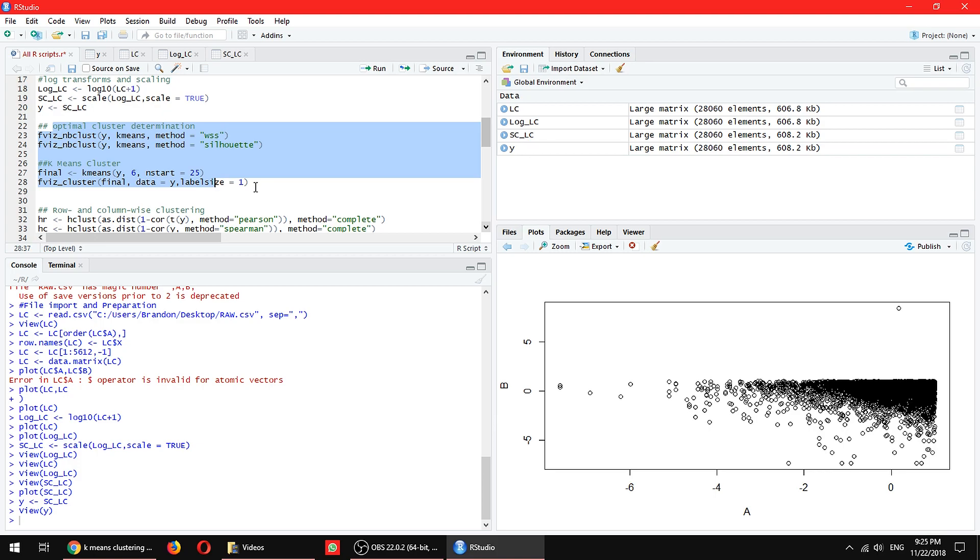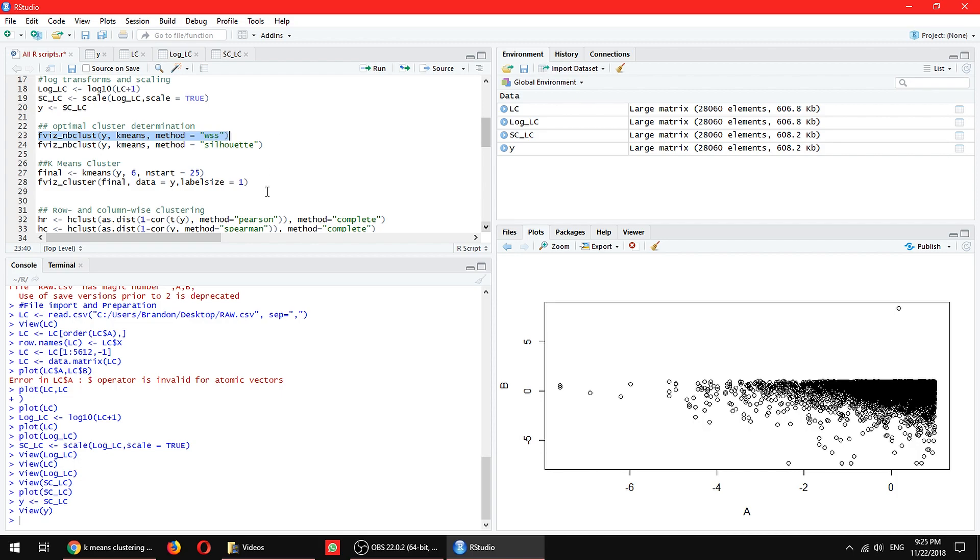The code here is fairly simple compared to what we have just now. So the first one is this elbow method. It's also called WSS here. I'm not sure why I haven't read the thing. If you know, just comment down below and make sure you tell everyone about it.